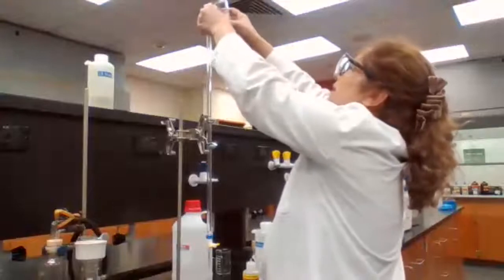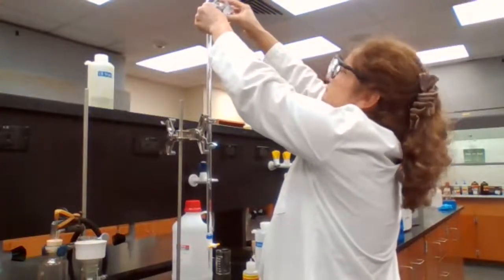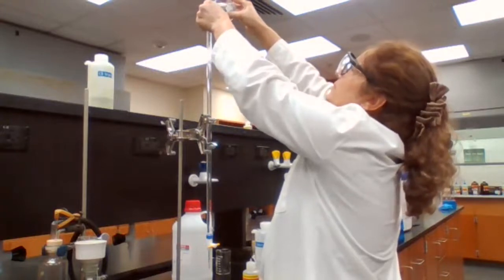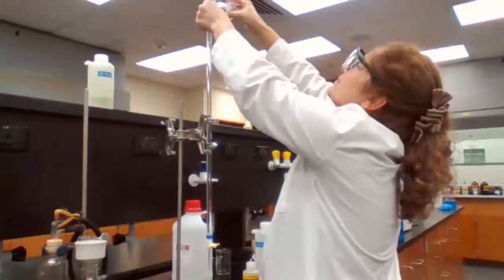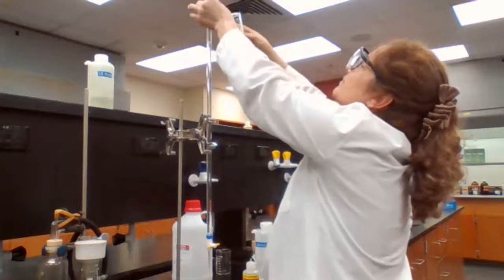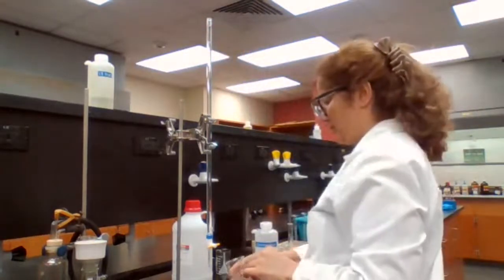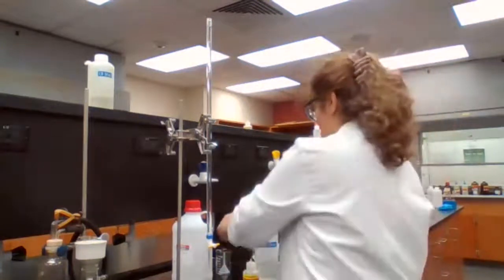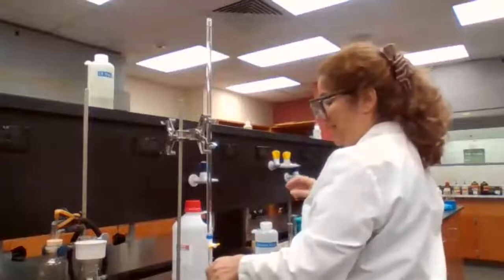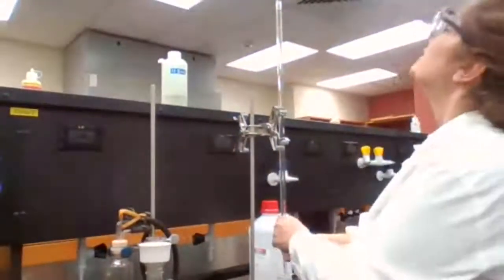To fill up the burette with sodium hydroxide, I'm going to drain some to make it align with the zero line.